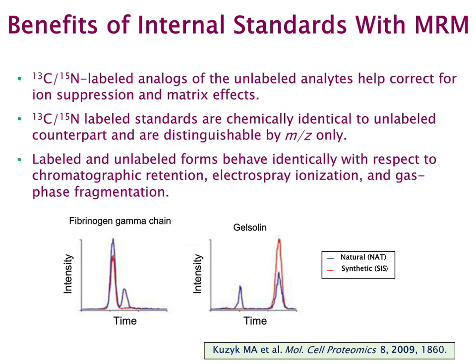same relative abundance. One of the major challenges of targeted peptide analysis is the prevalence of interferences originating from other peptides and small molecules in the sample matrix. After trypsin digestion of the plasma samples, hundreds of thousands of peptides are produced. Interferences manifest themselves in 2 ways: ion suppression and transition interference. Suppression decreases the ion current response in an unpredictable and unreproducible way.